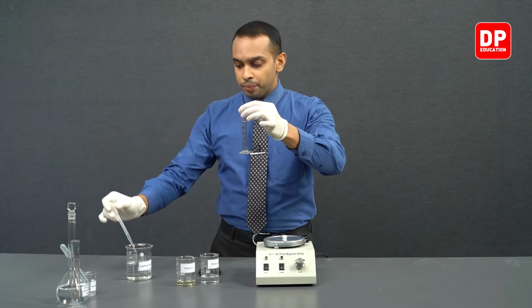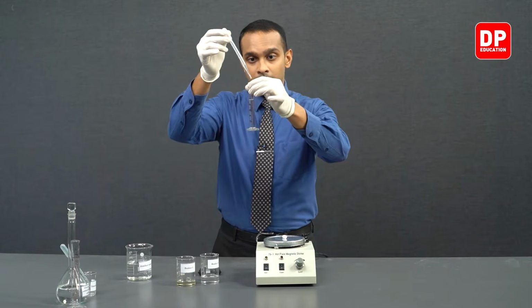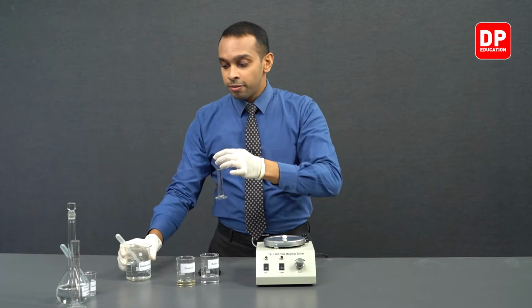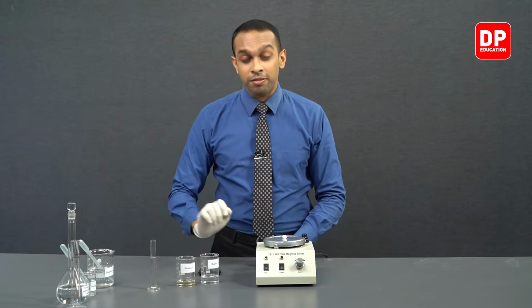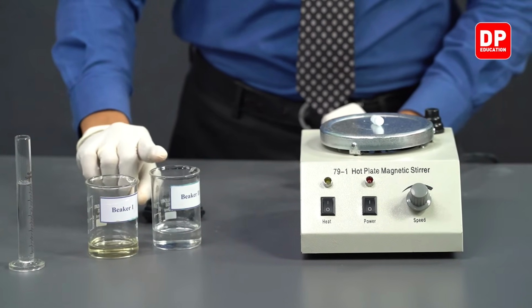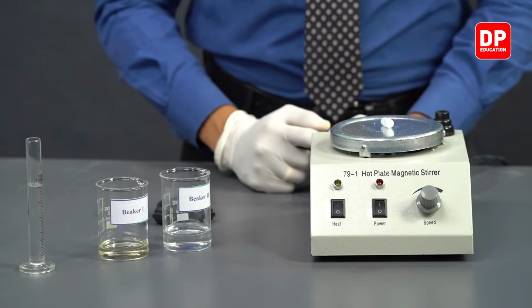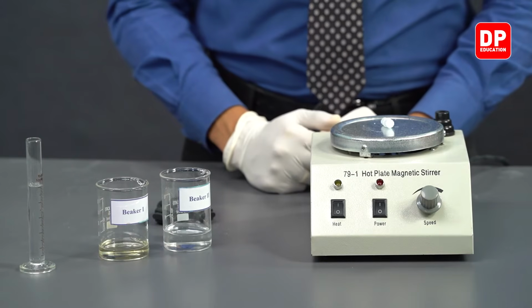When we were measuring Fe3 plus aqueous ion solution, we have only measured 15 cubic centimeters of Fe3 plus aqueous ion solution. So we have 15 cubic centimeters worth of volume here, and then in beaker 2 we have 10 cubic centimeters of potassium iodide and 15 cubic centimeters of sodium thiosulfate.